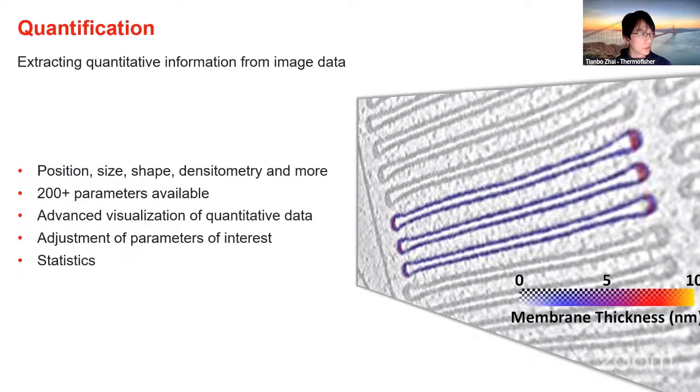Inside the AMIRA software, there is a long list of available measures that you can choose from. And of course, you can customize those measures. But again, to be able to assemble and understand a particular measure in the context of AMIRA, you may need to read through some of the detailed descriptions under the user's guide. But many of the common measurements that you are familiar with are there. And in addition, there are some measurements that are more unique in the context of AMIRA.